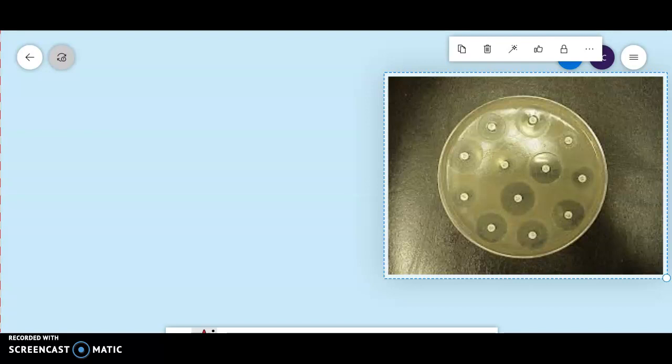Welcome back, learners. So today we will be discussing another aspect of your microbiology, and that is very important in the pharmaceutical industry, and also presently in clinical microbiology, medical microbiology, the emergence of drug resistant bacteria and so on. So this particular lab is very important because it will tell you how to determine your antibiotic or antimicrobial susceptibility testing.